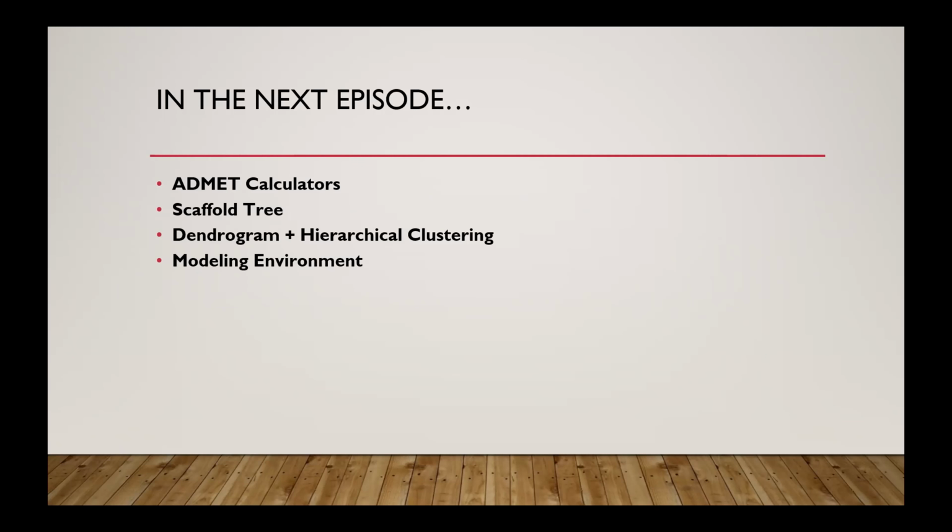So absolutely, any questions how to save layouts, projects, files? We can do a demo. It's your time.